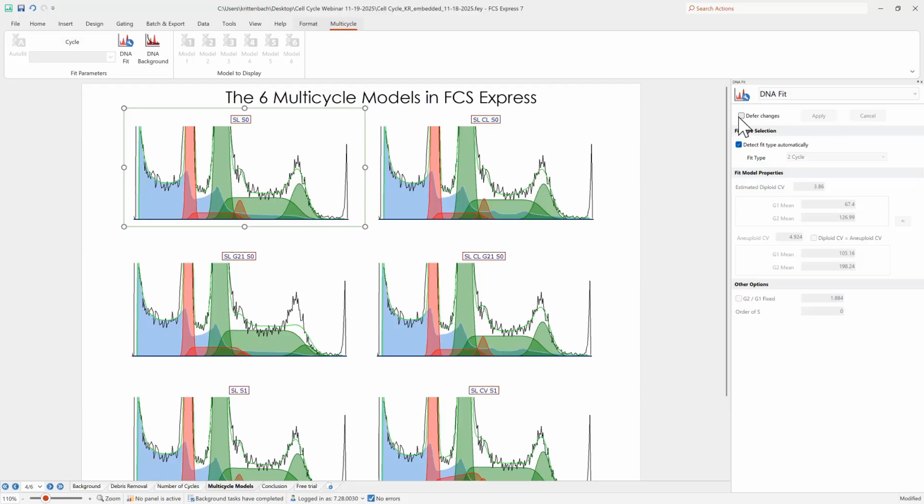This is useful if you'd like to check that checkbox, make a bunch of changes to this category, and then after you're done making those changes, apply them at once. This can help with the model not automatically updating in real time every time you make a change. You might want to pause the changes, make your settings changes, and then apply those settings changes at once.